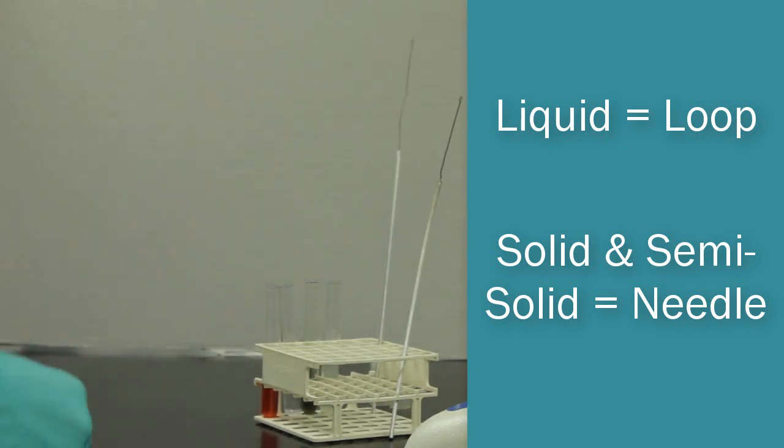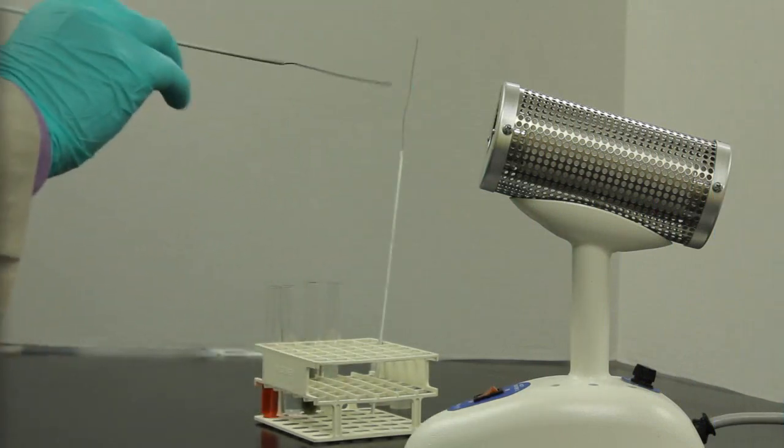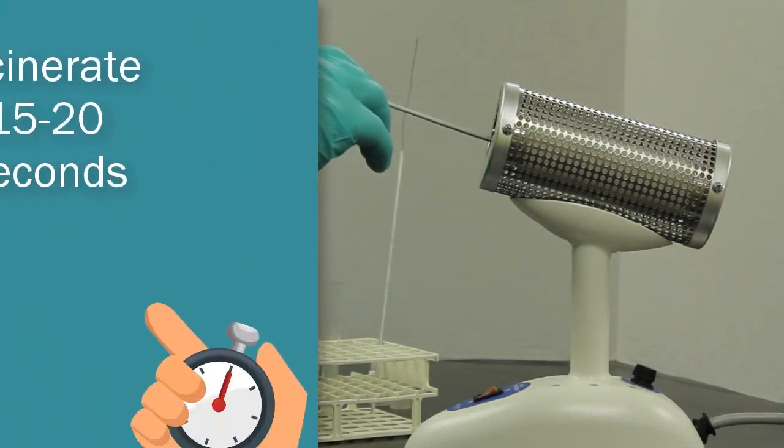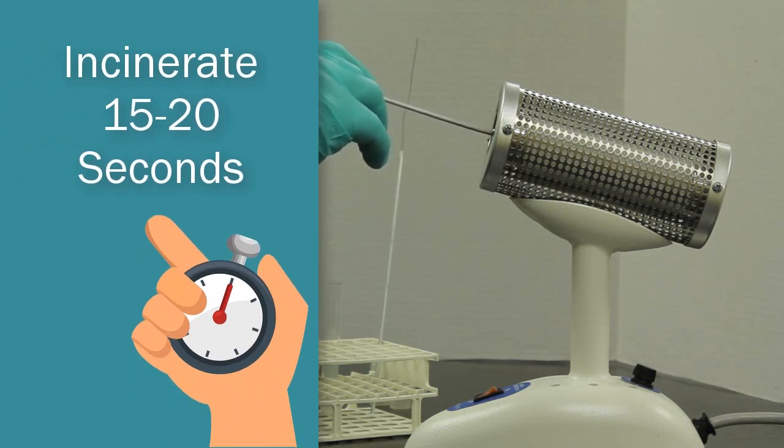In order to inoculate this media, you simply take the loop. We're going to do the liquid first. Insert the loop into the incinerator for 15 to 20 seconds until it's fully sterilized.